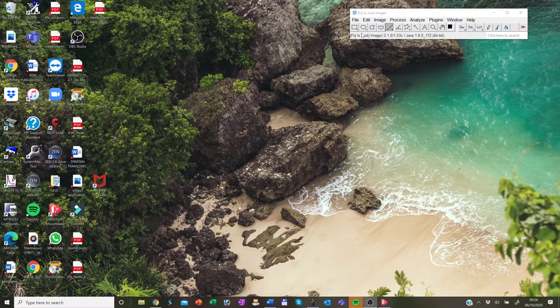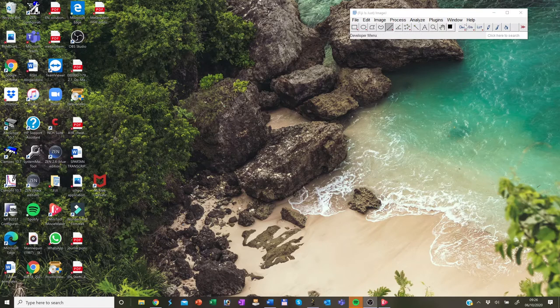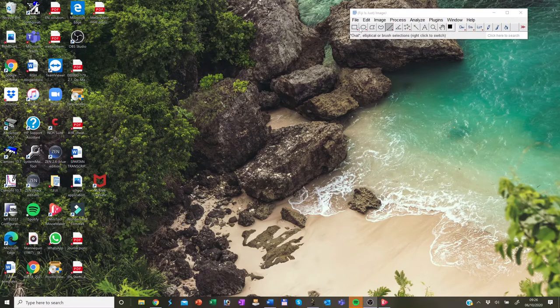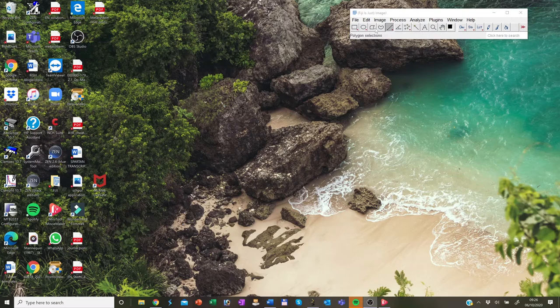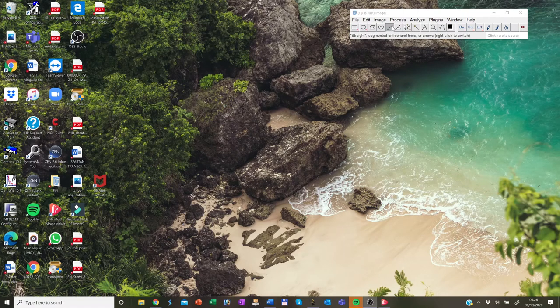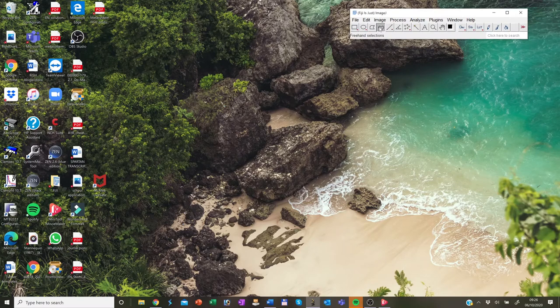The toolbar mostly contains selection tools, as you can see down here. Some of these are rectangle, oval, polygon, freehand, or the straight line. Now, by clicking on the icon, you activate them.